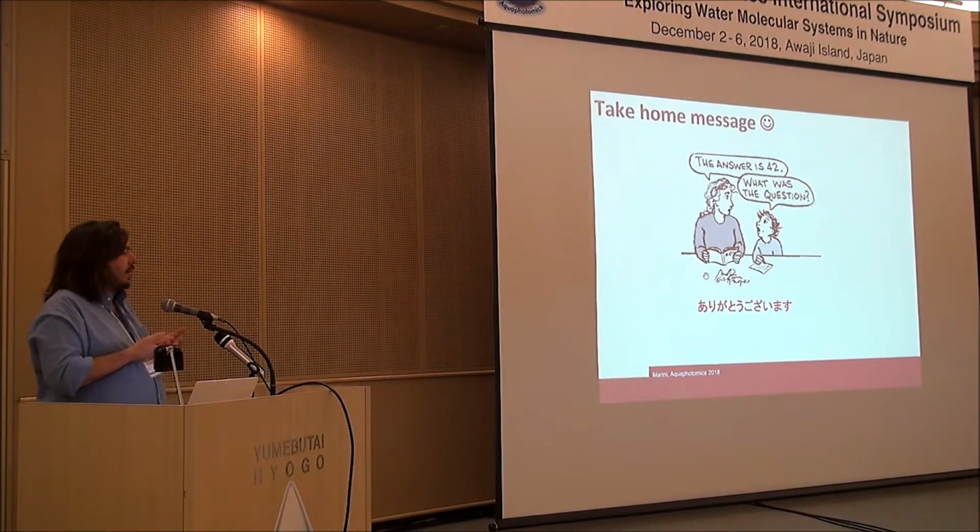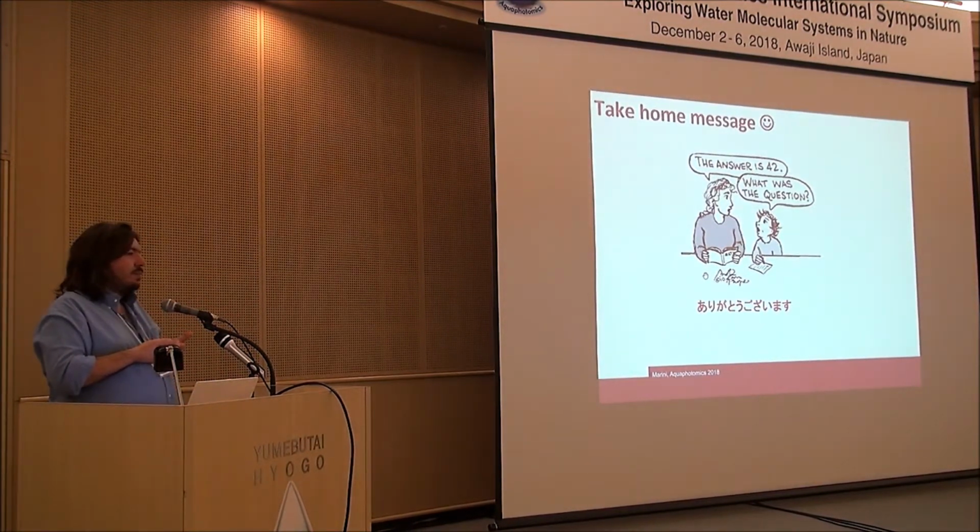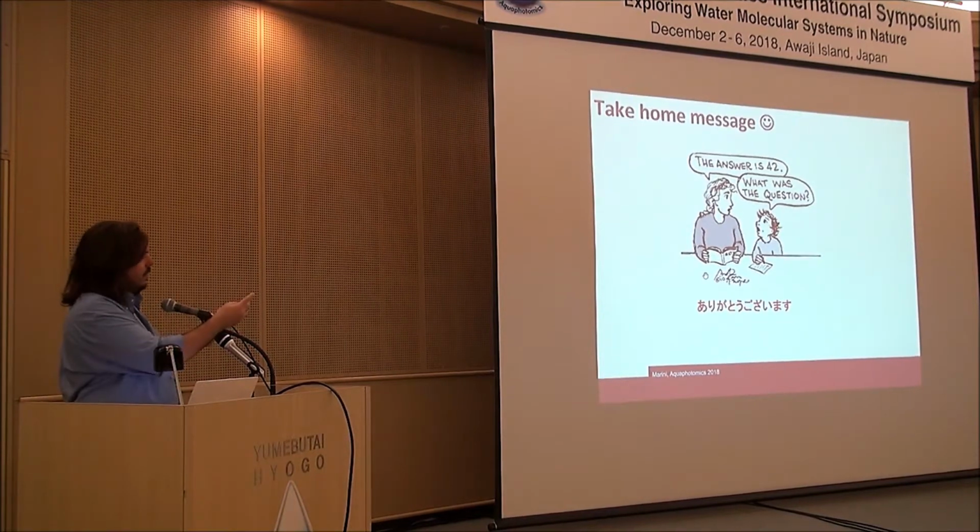Also, since MCR is not sequential, differently than PCA, a model with 4 components is not a model with 3+1.